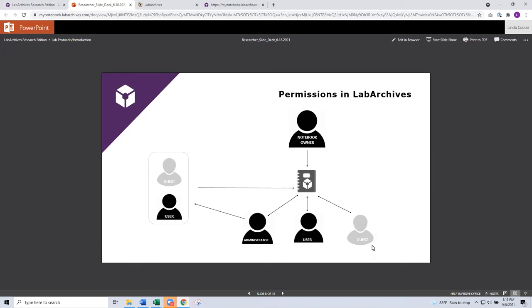Another role that's available is the guest role. Guests are really well suited for perhaps external collaborators — perhaps somebody outside the university at a partner institution that you want to collaborate with. You can invite them as a guest, and a guest is given 60 days of read and write access, but you can also adjust or extend their access at any time. Guests are also well suited when they need to see only a section of the notebook and not the entire notebook.